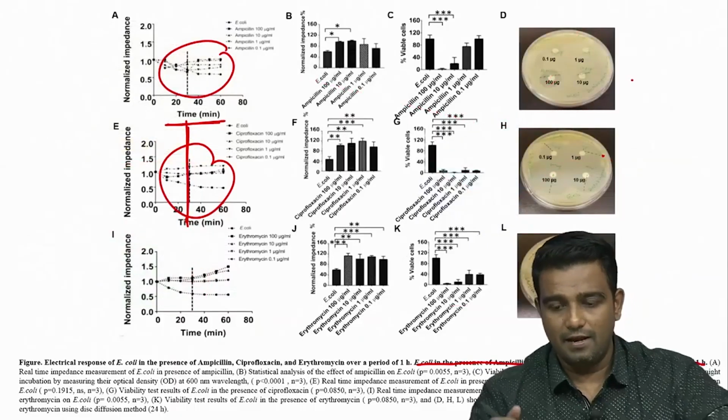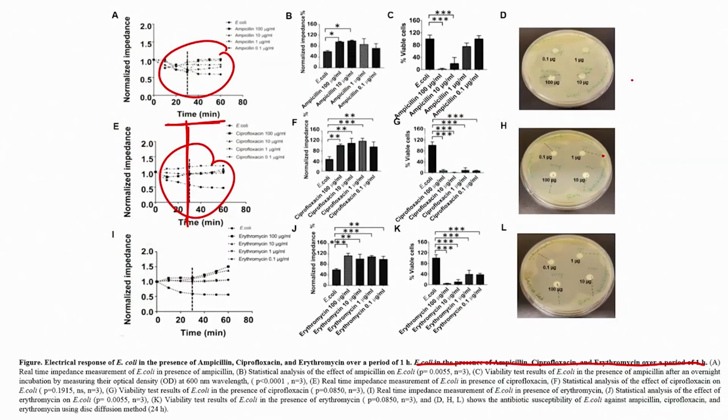If you see this slide, you can see that if the antibiotic is effective, you will see a significant difference between the control and the actual sample, the sample that is studied, right guys. So this is how we can quickly, rapidly measure the effect of an antibiotic. We can capture the bacteria in an effective way, and the reason this happens is because we are using microfluidics. So if you use microchannels, you can capture the bacteria, and the amount of bacteria that doubles, we can immediately see the change using electrical sensing.